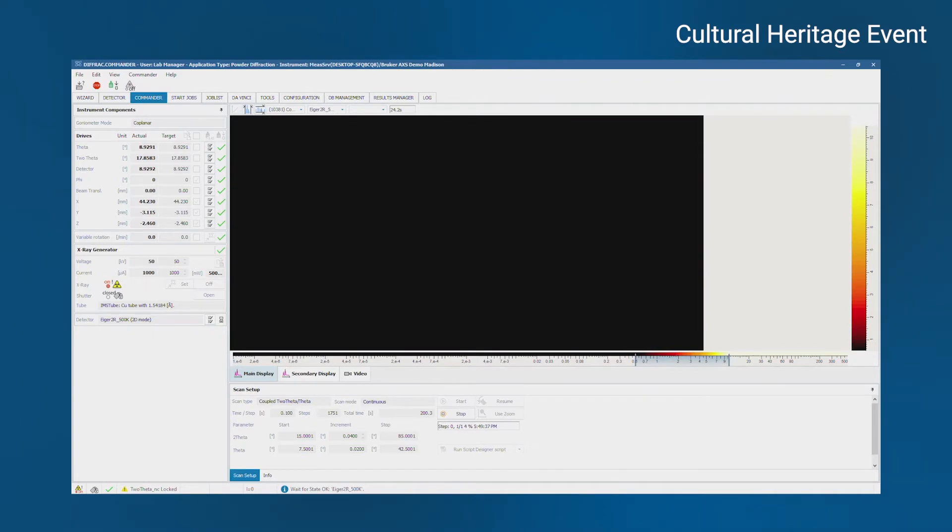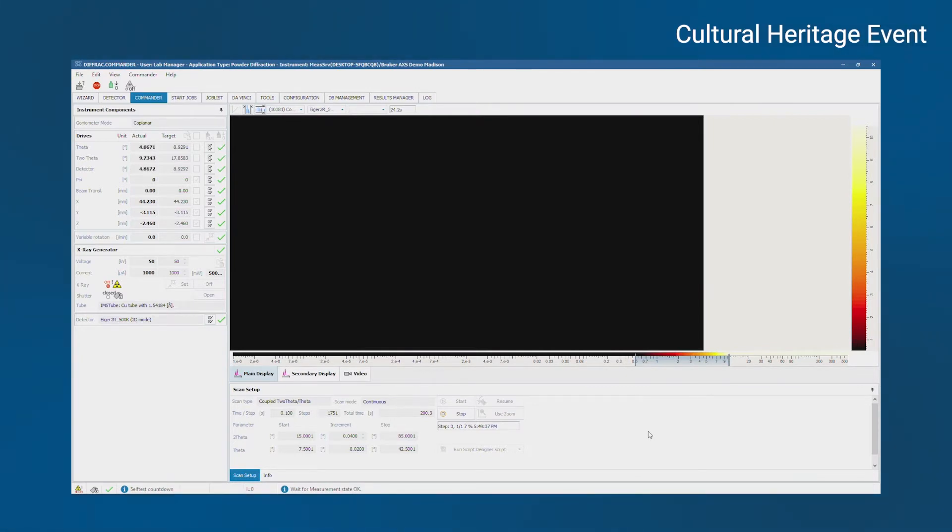But because we have an area detector, instead of having just a single line going across the image, we have a 2D frame sweeping from left to right, as you'll see.